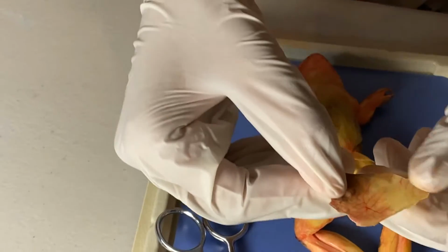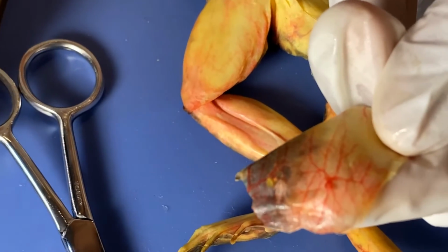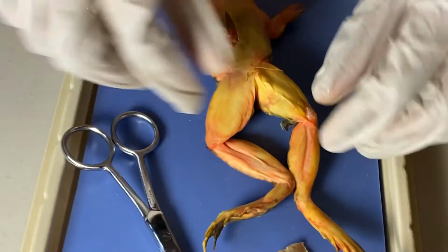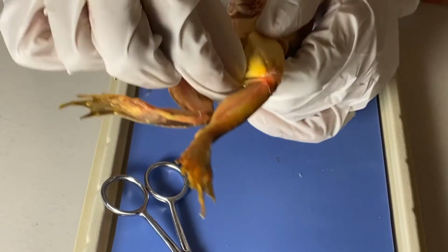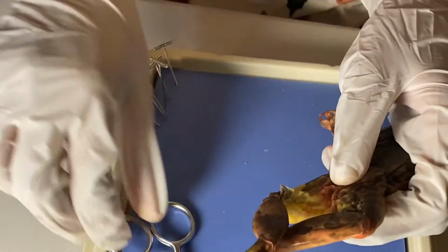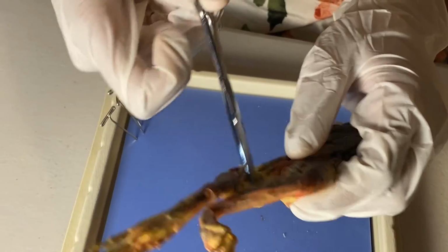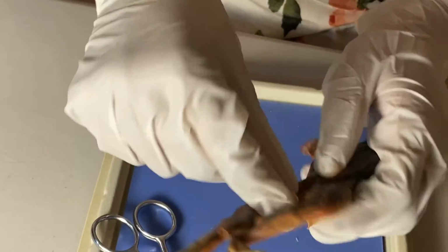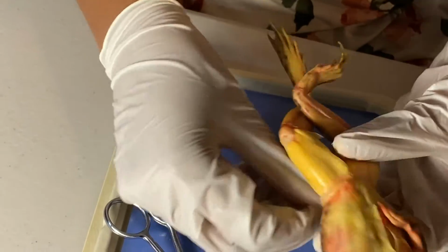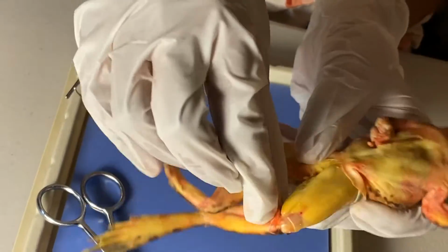And you can see that on the skin of the frog, there are many blood vessels running through. So I'm going to continue removing the skin. And we're going to see the muscle.